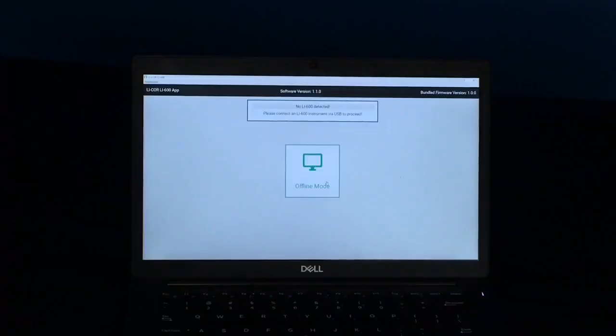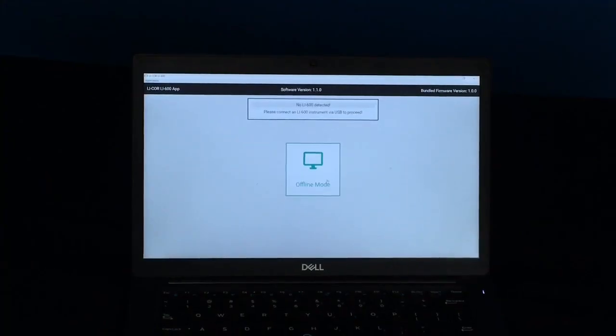Today I'm going to take you through how to set up your LI-600 using the embedded software and the application software. So you can find the LI-600 software on the website, so on licor.com/env.